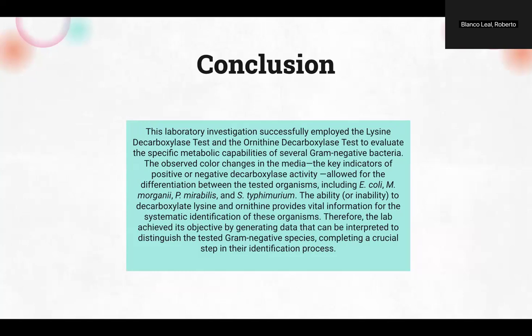So this laboratory investigation successfully employed the lysine decarboxylase test and the ornithine decarboxylase test to evaluate the specific metabolic capabilities of several gram-negative bacteria. Observing color changes in the media, the key indicators of positive or negative decarboxylase activity, allows for differentiation between the test organisms, including E. coli, M. morganii, and the rest. The ability or inability to decarboxylate lysine or ornithine provides vital information for the systematic identification of these organisms. Basically, it's saying that it's going to show the activation of catabolism.